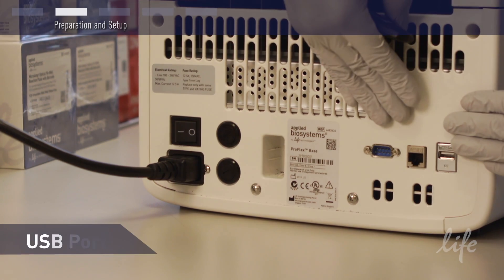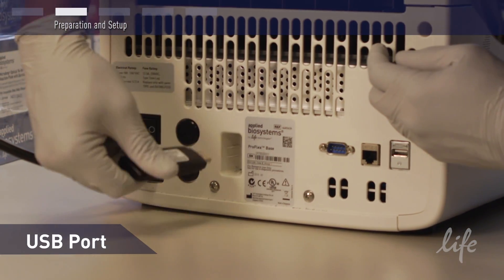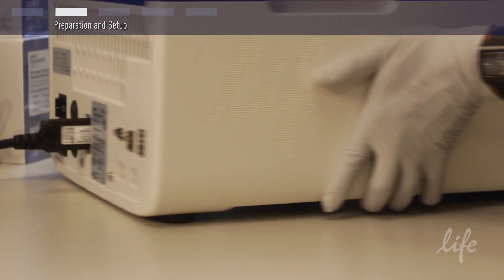On the back of the base, you will see two USB ports. Attach the wireless antenna to one of these ports. One of them is recessed to make it easier to attach. Position the system as you wish on your bench for use.